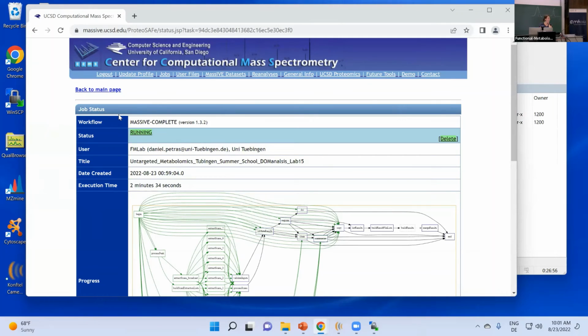The other really important aspect is that such a data set, for me, evolves as my study goes on, right? Because what I do at the beginning is upload the raw and the mzML files and make them public, so they're nicely accessible to the dashboard and to all the GNPS tools with my collaborators.